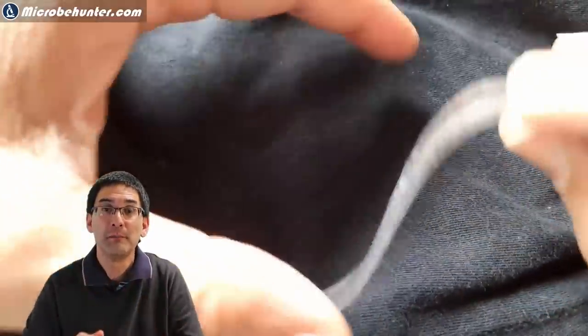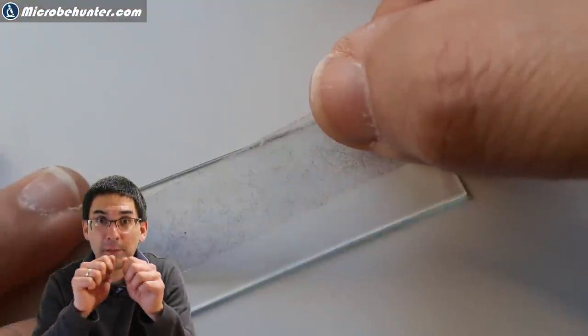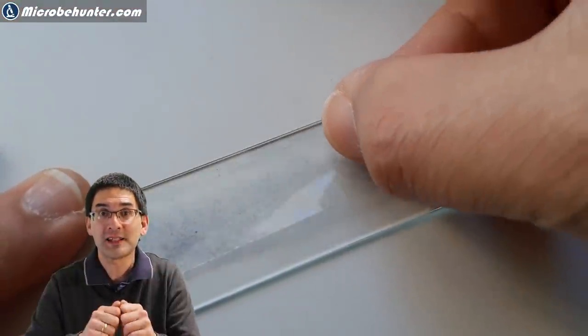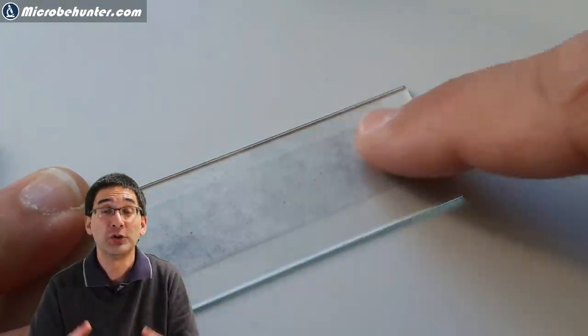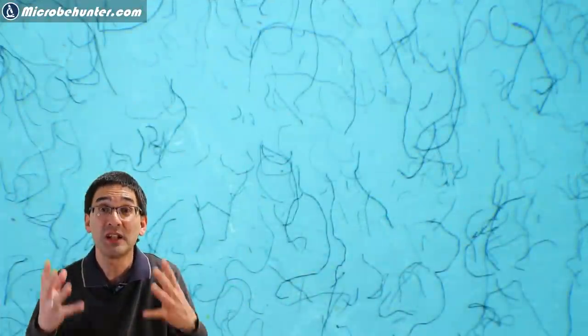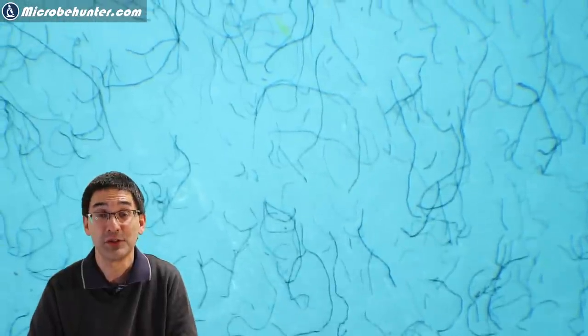And along come many of these fibers. I put everything on a microscope glass slide and under the microscope we can already see that there are not a few but maybe thousands of these textile fibers. Most of them are not able to move because they are stuck down to the slide.